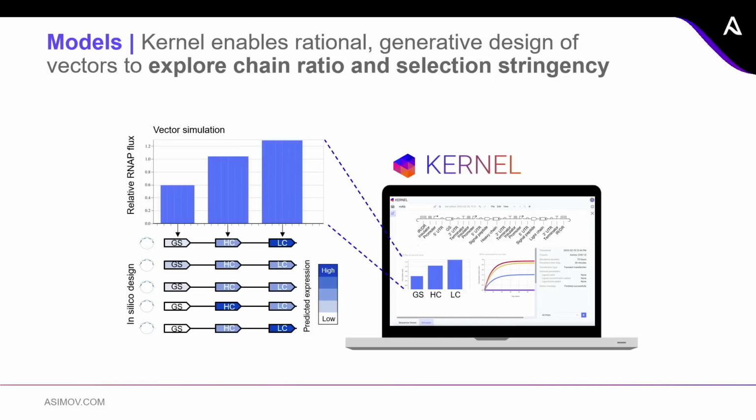And then just a little more detail in this example of that software. Here's an example of 5 different in silico designs that we did. And so we can adjust the promoter strengths of these 3 different parts and then change the order as well to tailor-make that expression so that it's specific to each molecule.